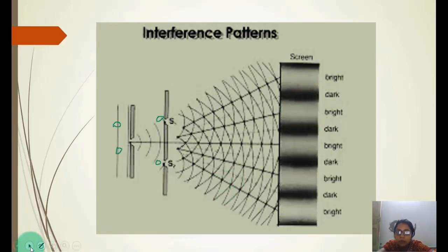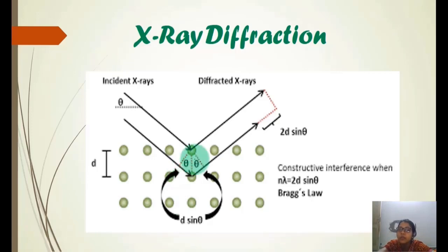But if you are using X-ray, you don't know where this light is coming from and where this light is going. So what we do, since the X-ray source and the diffractor, this is the incident beam, the incident beam gives you the angle of the diffraction basically, and this is determined from Bragg's law.